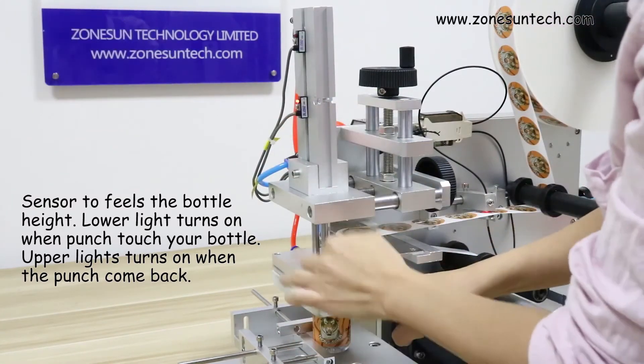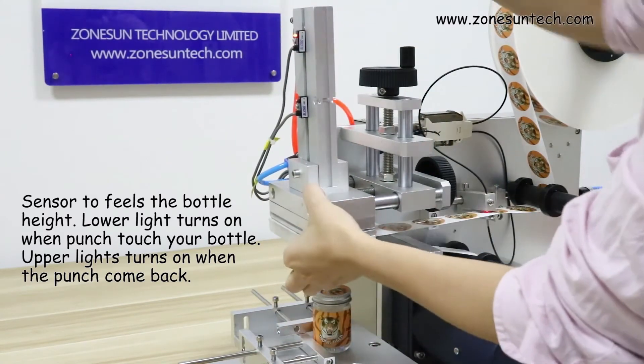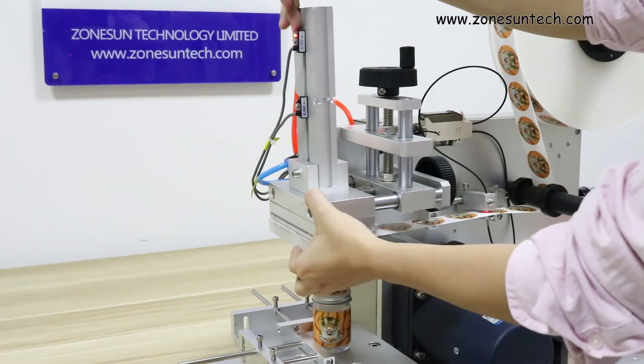When you touch the product, this line light will turn on. You can move it and then tighten the screw here to keep the line light on. And this one here — when it comes back, the upper light will be on like this.